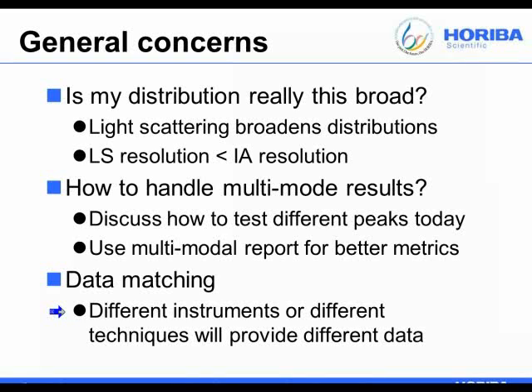If you have a centrifugal sedimentation device, it's going to be measuring something called the Stokes diameter, which is different than the equivalent spherical diameter a laser diffraction instrument may measure. So if those terms don't make any sense to you, there's a slide later on in the presentation that helps explain that a bit better.